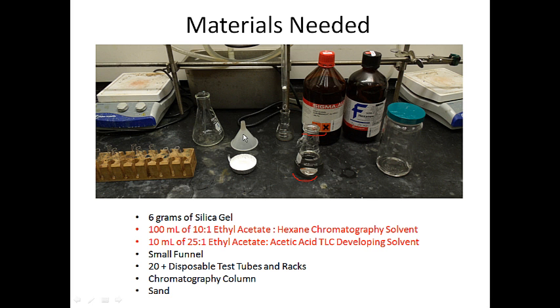I will provide you with some small plastic funnels that will actually fit into these small columns. It says to use a funnel that has a long stem on it. We're going to use a funnel like this, and this is not the same powder funnel that you have in your drawer, so there'll be a separate funnel for you to use. And if you wrote in your pre-lab assignment that you're going to use a long stem funnel, you can go ahead and make that procedural change that we're going to use a small plastic funnel.